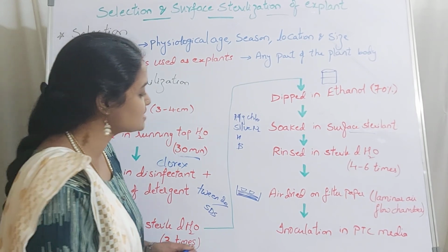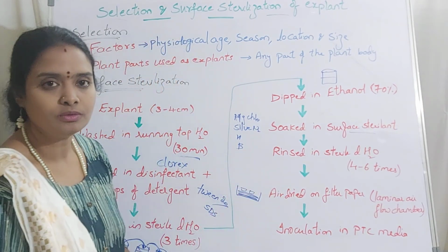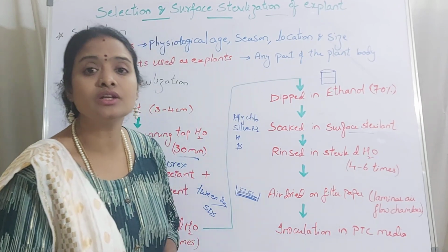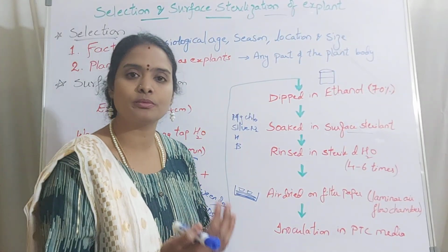So once it is air dried, now these explants will be transferred into plant tissue culture media, right? That is nothing but your inoculation of the explant in plant tissue culture media, followed by incubation.